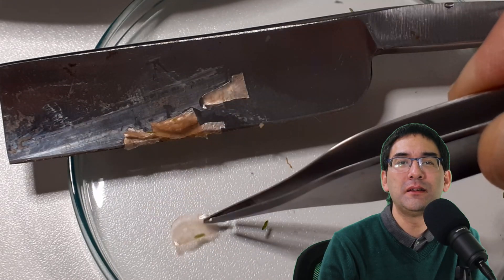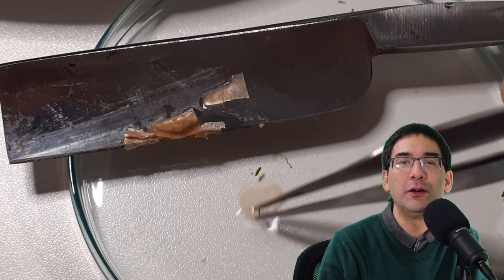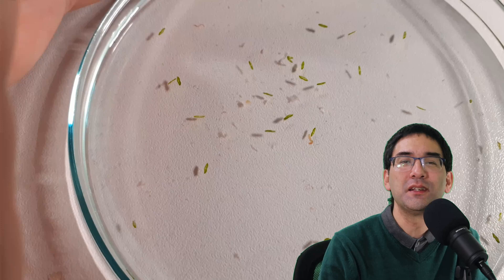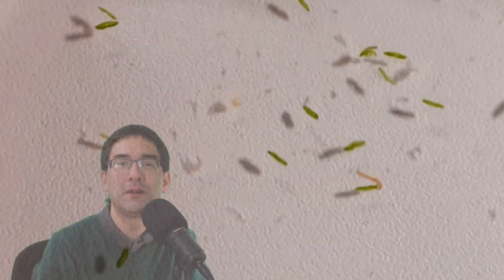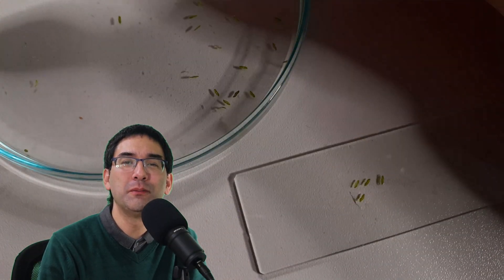I then placed each section into a little bit of water to prevent them from drying out. This also removed some of the carrot pieces that might have disturbed the image quality. Here they are swimming in water as I wash them at the same time.